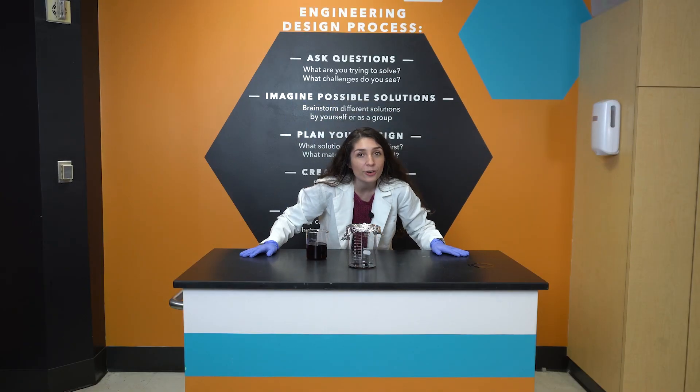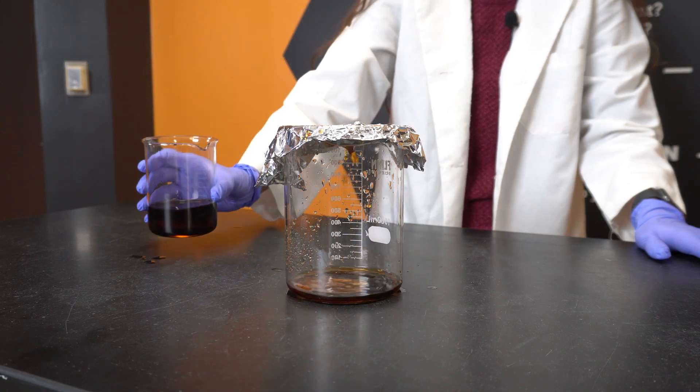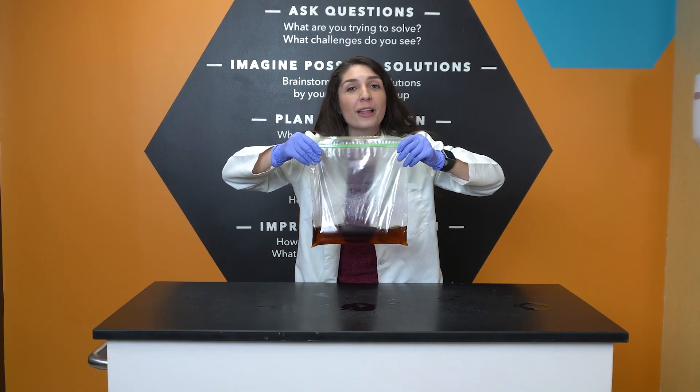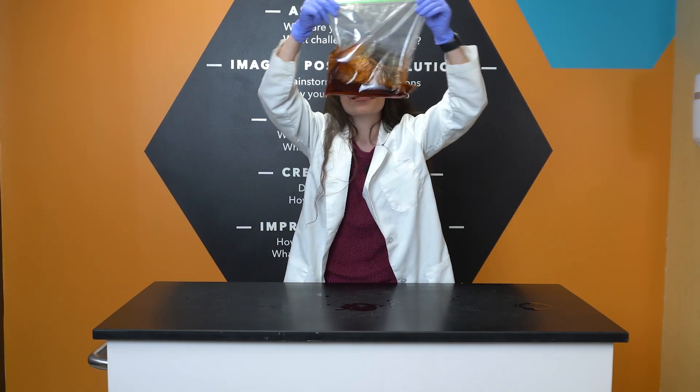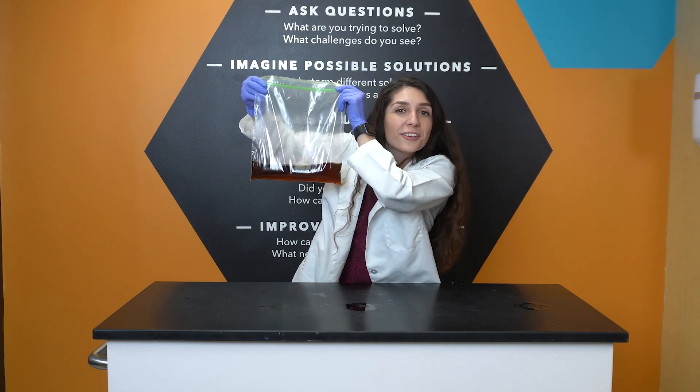But why is it there? Well, like our sodium hydroxide solution, our soft drinks can also corrode the aluminum can. This causes chemical leaching, which can be dangerous. Which is why the plastic is there in the first place. If sodium hydroxide can't dissolve plastic, then neither can our soda.